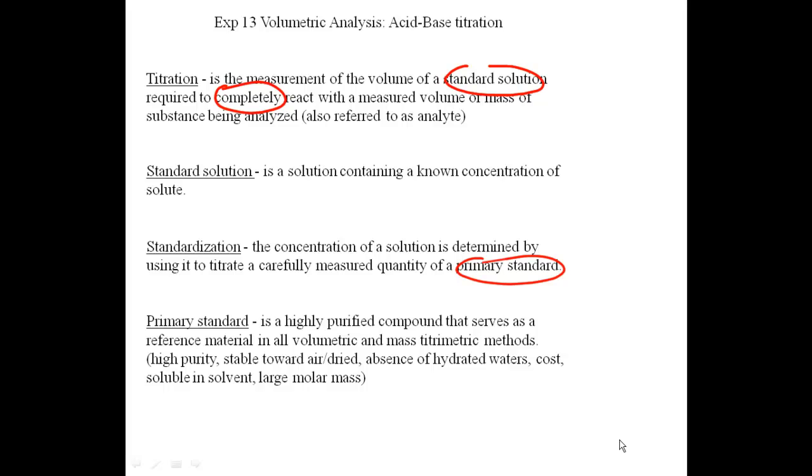Sodium hydroxide is one we use today. The problem with sodium hydroxide is that it's very hygroscopic, which means when I'm weighing it on a balance, if I'm trying to weigh out 1 gram of sodium hydroxide, it's absorbing moisture from the air immediately. So when I weigh about 1 gram, I have sodium hydroxide as well as water in that sample.